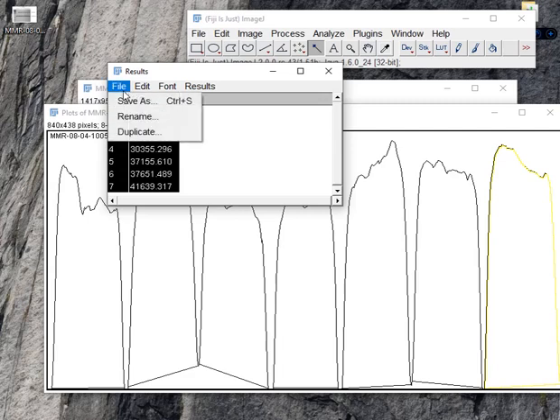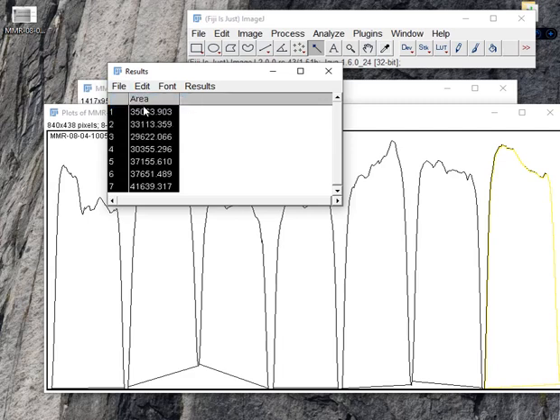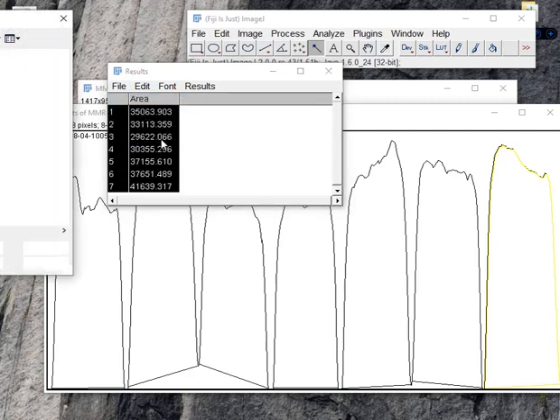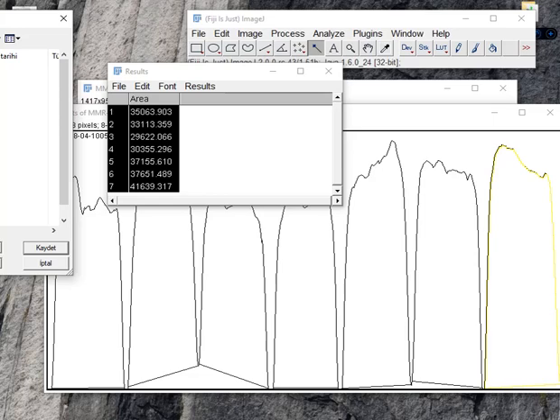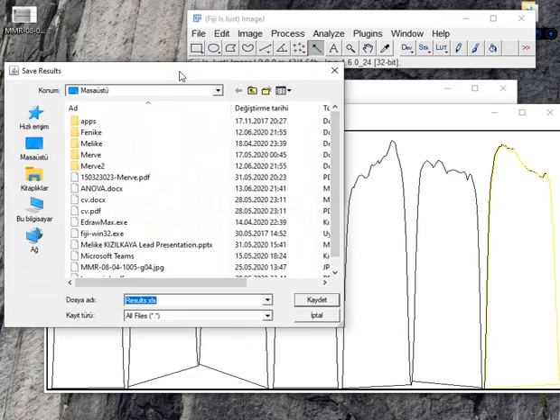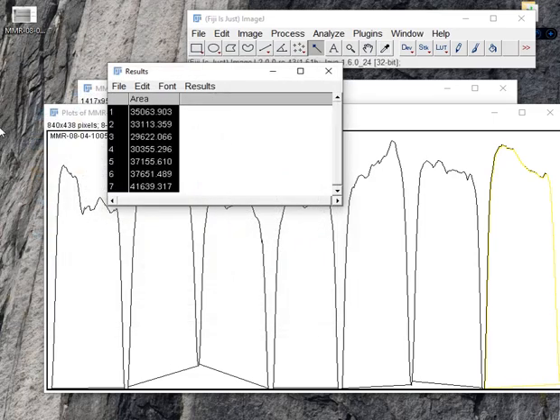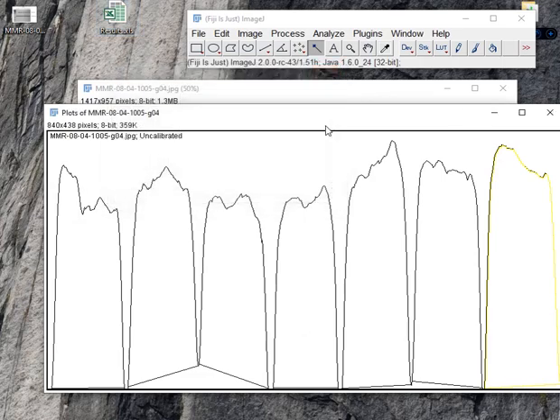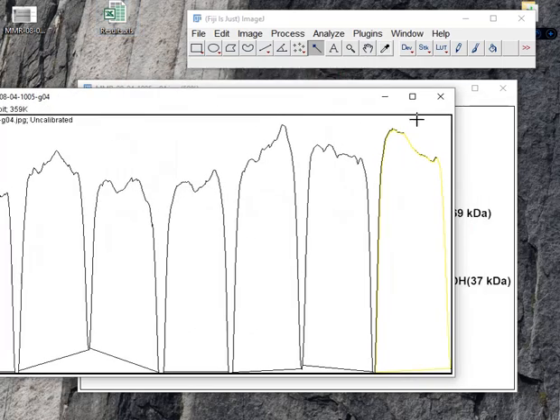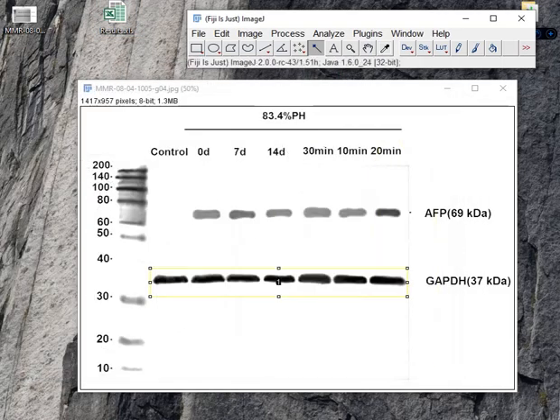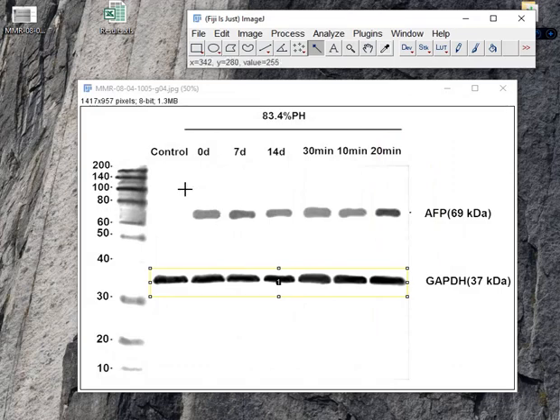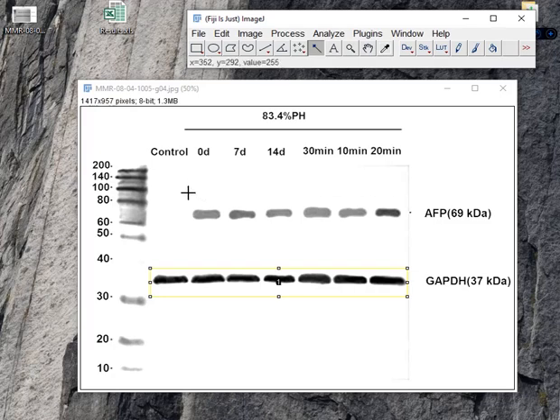So you can save this file. I save it. Then you have to select the second band and do these steps for these bands.